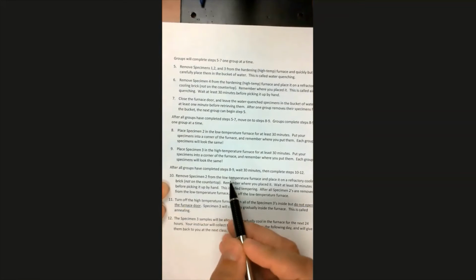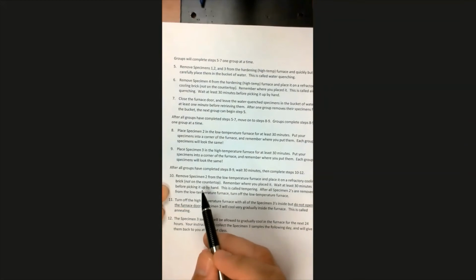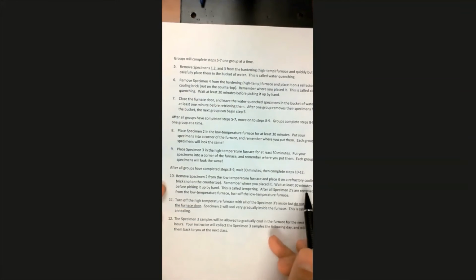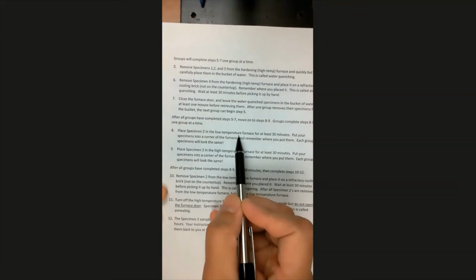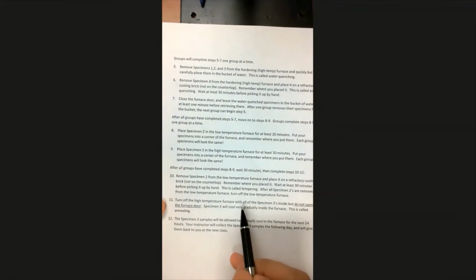Now, specimen 2, remember that's being tempered. We are going to take it out of the low temperature furnace, and we're going to put it on a cooling brick, and then we're going to wait. We're going to wait actually till you guys come in to pick up the specimens. We're going to wait for it to cool down. So this is tempering. We brought it up to slightly below the lower critical temperature, and then we're going to cool it down in room temperature air.